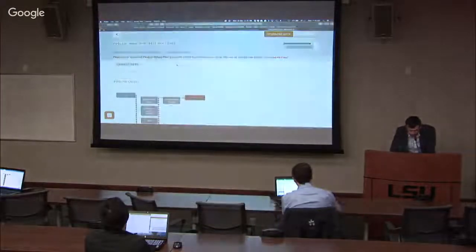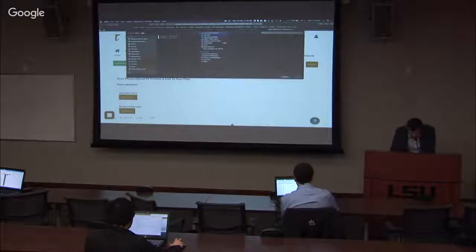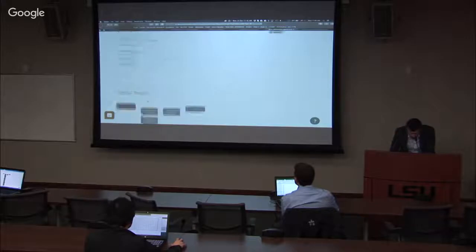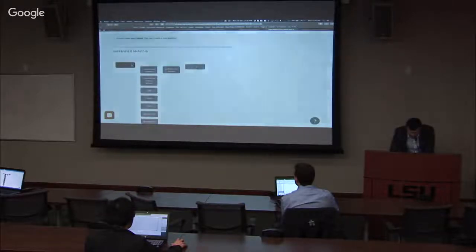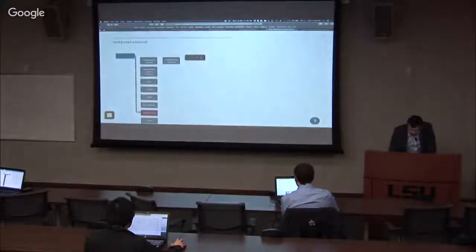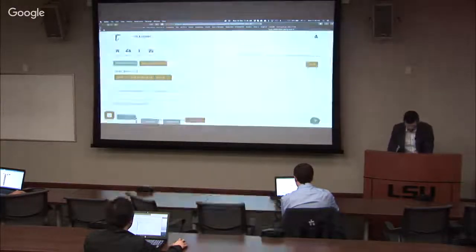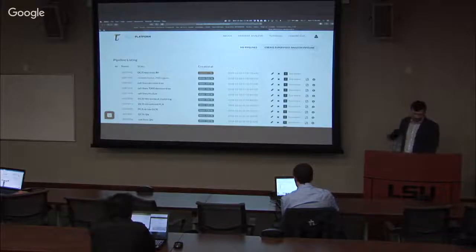All right, so now let's create our pipeline. So I'll take my test and train. There's my training test. And let's create random forest. As this is running, let's take a look at the result from the 7,000 genes.